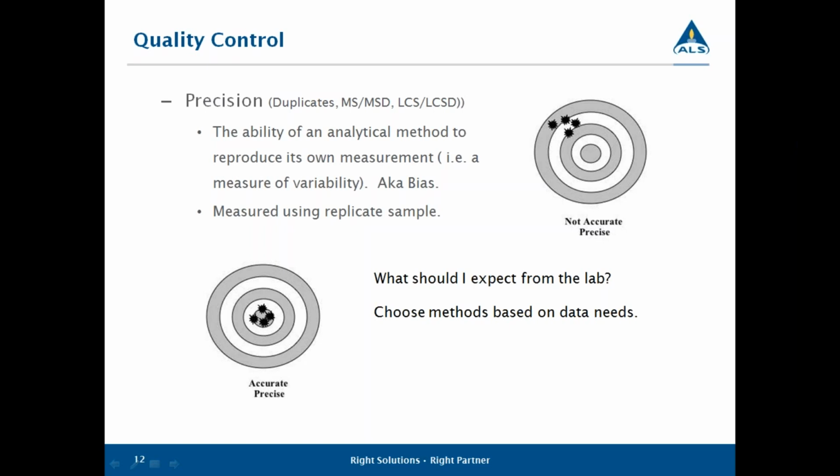First thing you've got to do is choose the methods based on your analytical needs. For example, take 1,4-dioxane analyses. The recovery in the full list of volatiles or semi-volatiles by GCMS methods is poor, but if you use SPE and SIM analyses on these, the accuracy and precision is much more reliable.